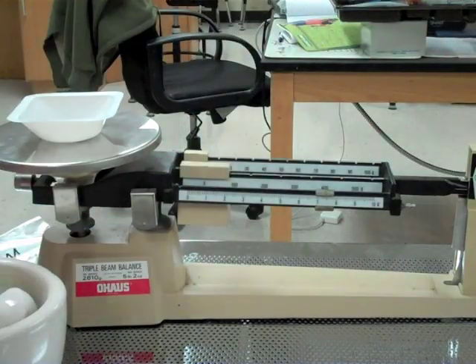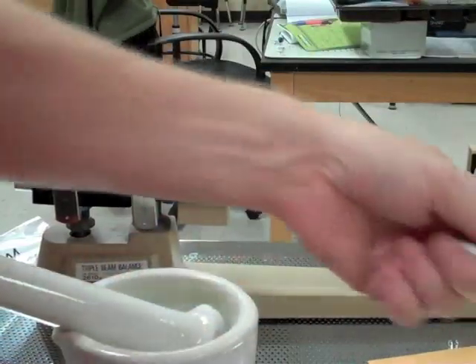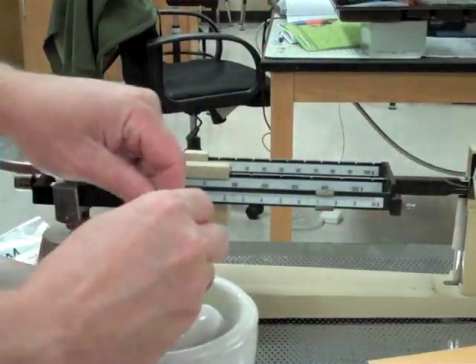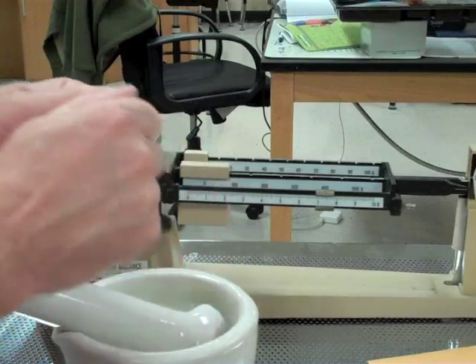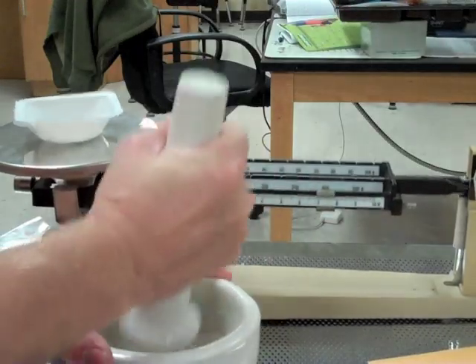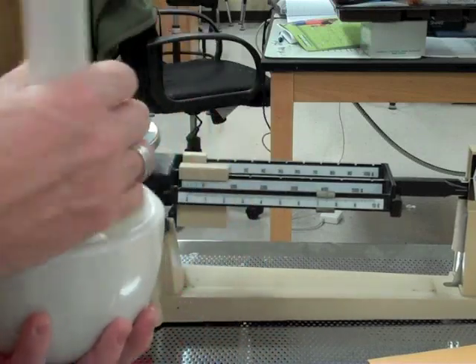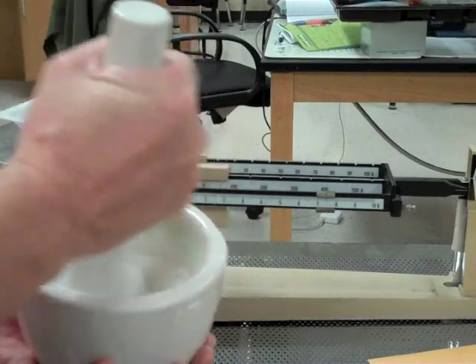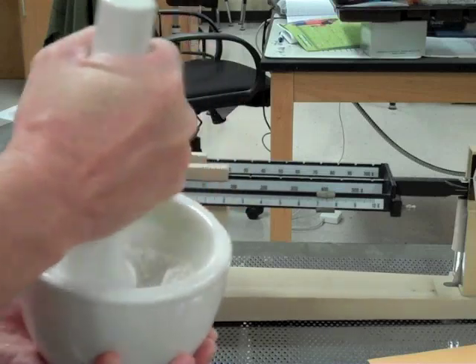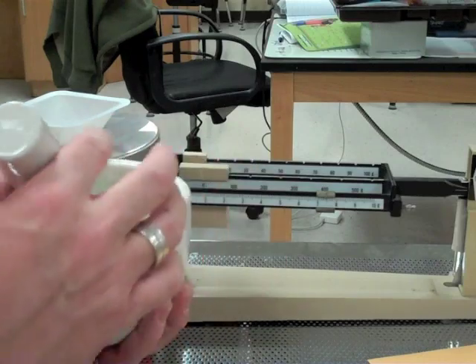I'm going to take some chalk out of my container, put it in my mortar and pestle — I've actually got some already crushed up, but I'll show you what I did. I took the piece of chalk and broke it up a little before putting it in. I'll crush up a little bit more and put it in there. I just kind of take the mortar and pestle and start grinding it up, moving it side to side to get it to a fine powder.